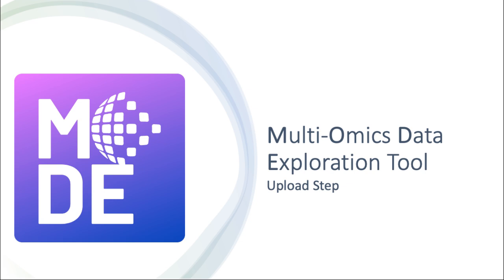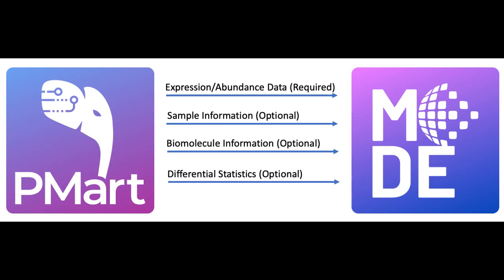Hello, in this video we'll cover how to upload data for visualization in Mode. Mode is meant to be used as a visualization tool for midpoints generated in PMart and iPMart. Midpoints are normalized and can include statistics results. For more information on midpoints, please see our map video tutorials.